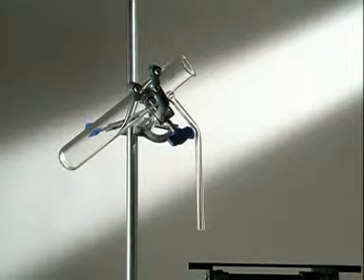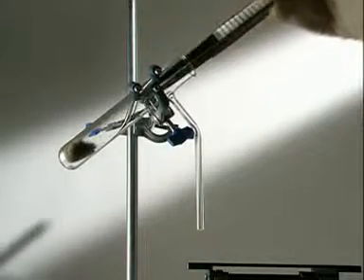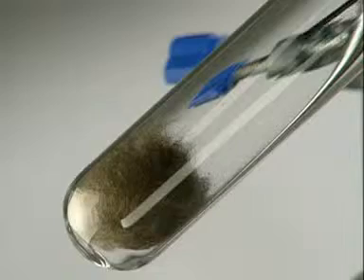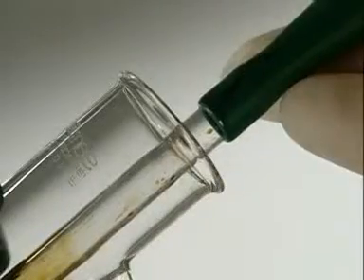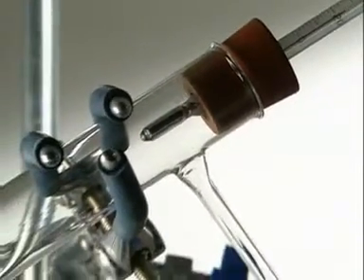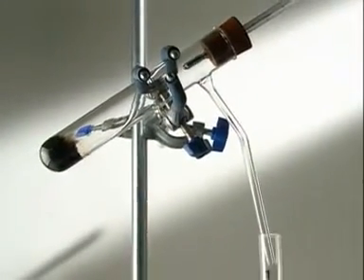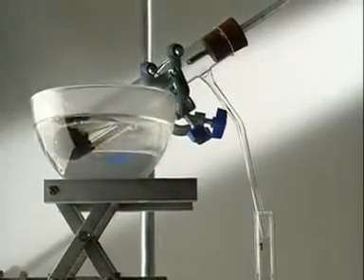This simple apparatus is set up in a fume cupboard. Mineral wool stops the mixture spitting when it's heated. Crude oil is dropped into the bottom of the tube. A collecting bottle is put in place. And a thermometer level with the sidearm monitors temperature. The final step is to gently heat the mixture by immersing the tube in a hot water bath.